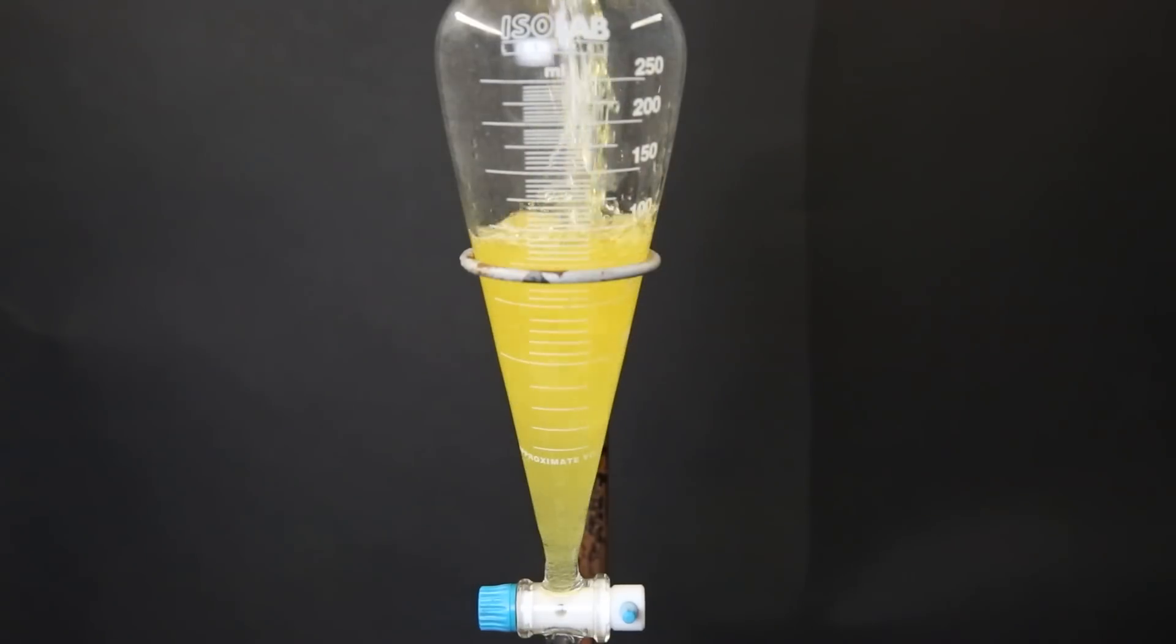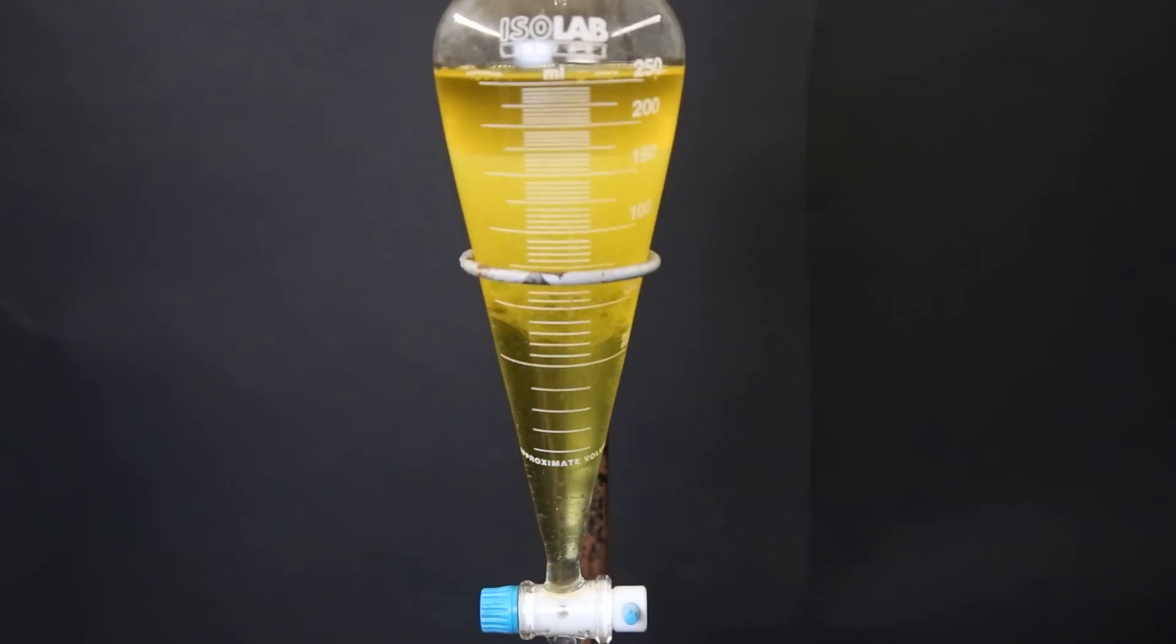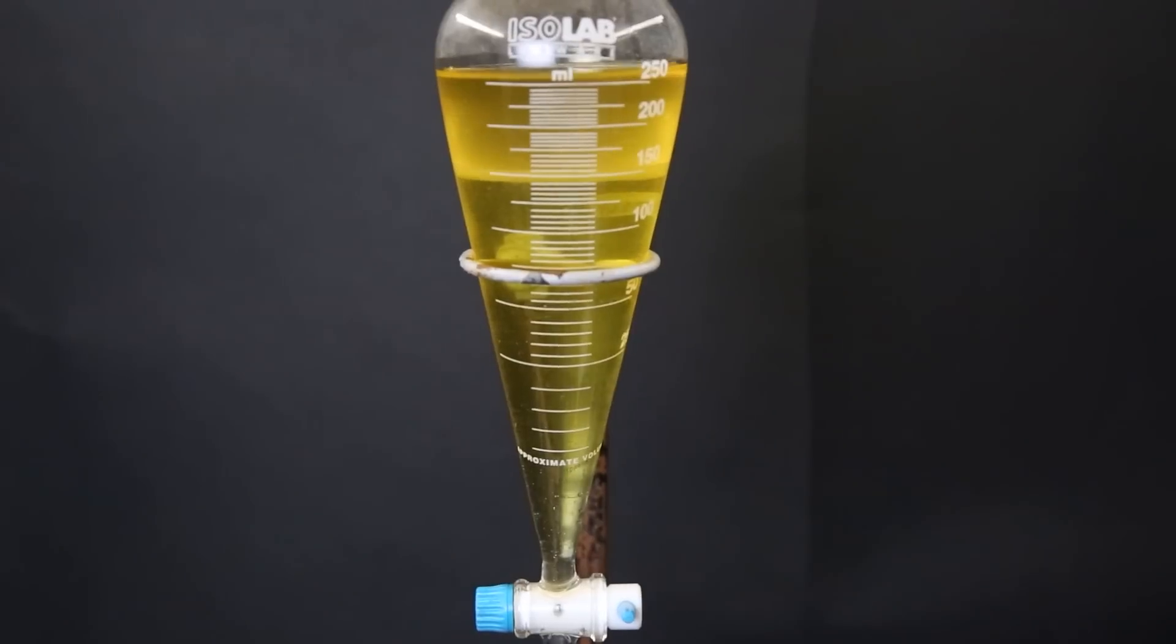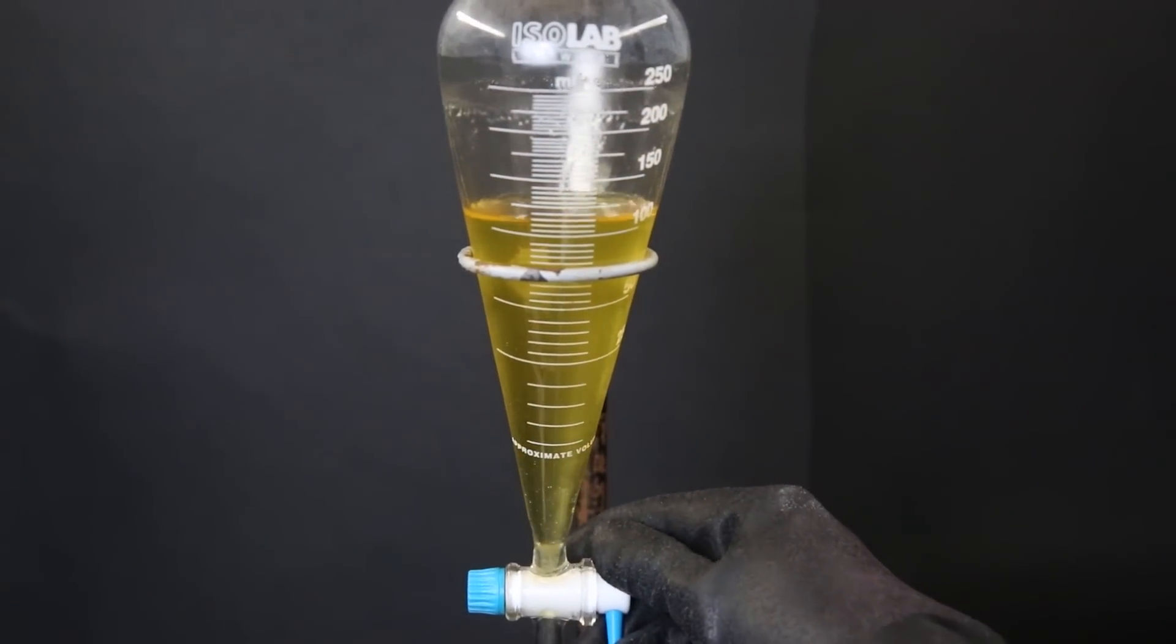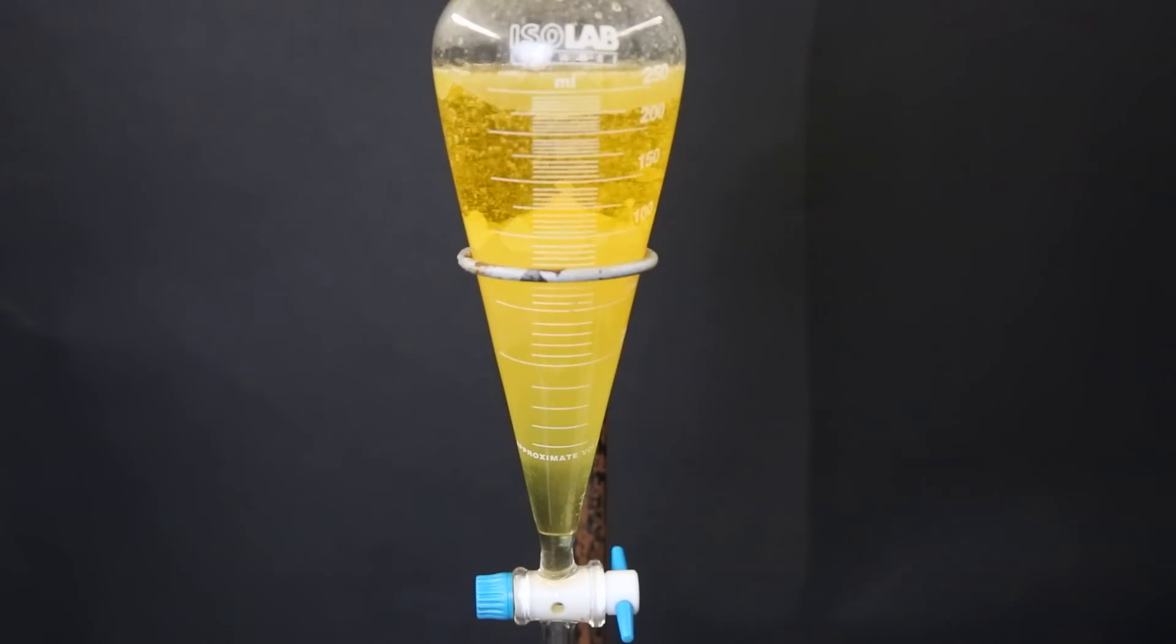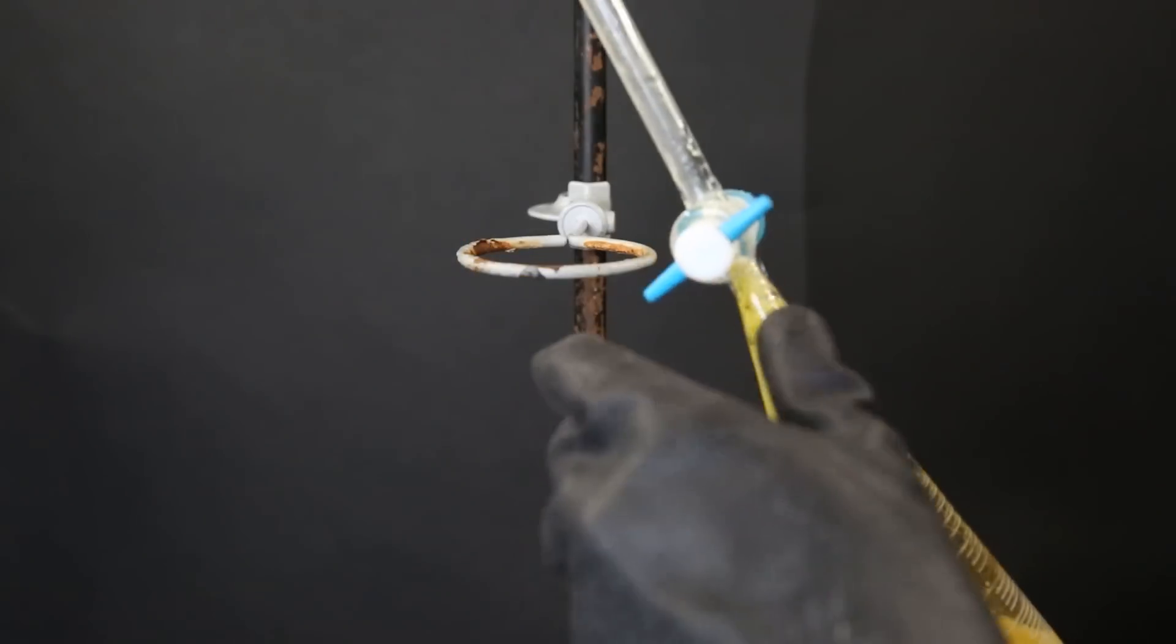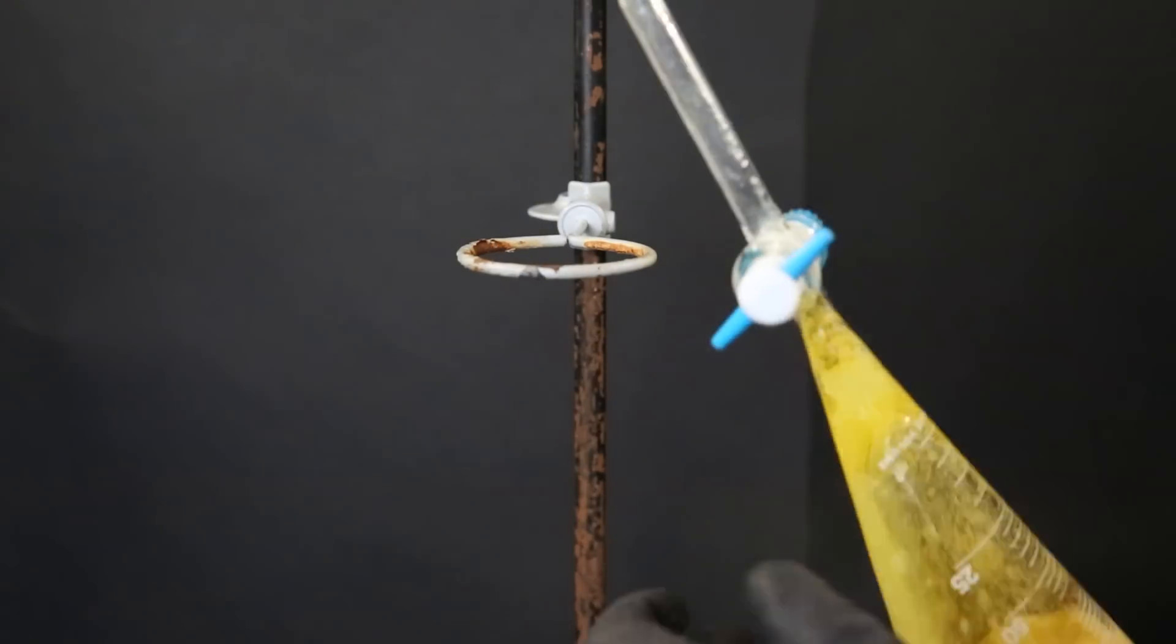I move the mixture to a separatory funnel and allow the layers to separate again. I then drain off the lower acid layer and discard it. Then I wash the remaining organic layer with some saturated sodium bicarbonate solution to destroy any remaining acid. It is probably better to wash it with water beforehand to remove the bulk of the acid, and then wash with the saturated sodium bicarbonate solution to react with anything that is remaining. As you can see a lot of pressure is building up in the funnel. Therefore it is a lot wiser to do a water washing beforehand.